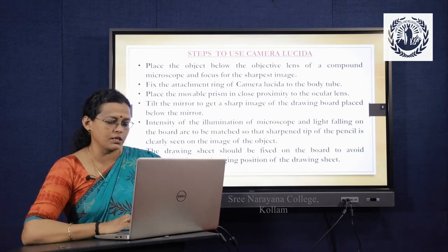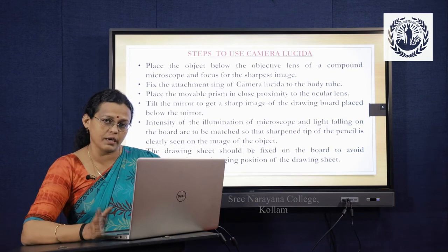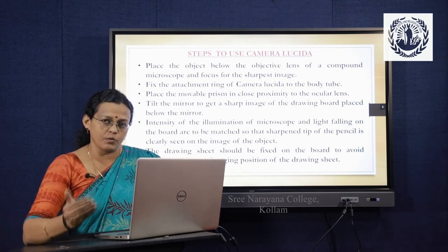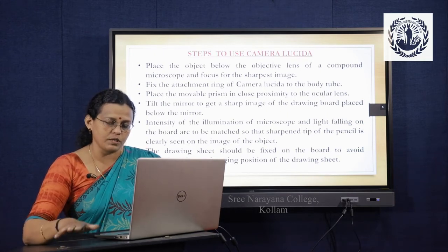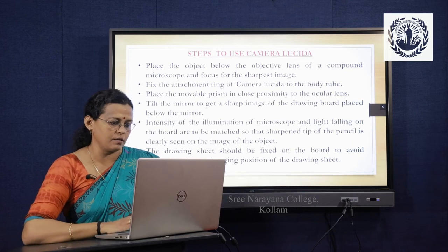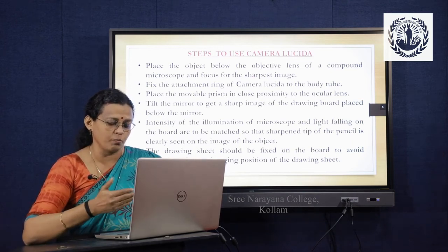The drawing sheet should be fixed on the board to avoid distortions. This is something which has to be taken care of even before starting your work. You have to fix this drawing sheet onto the side of the microscope so that it does not shift. Once the drawing starts, it should not be shifted.